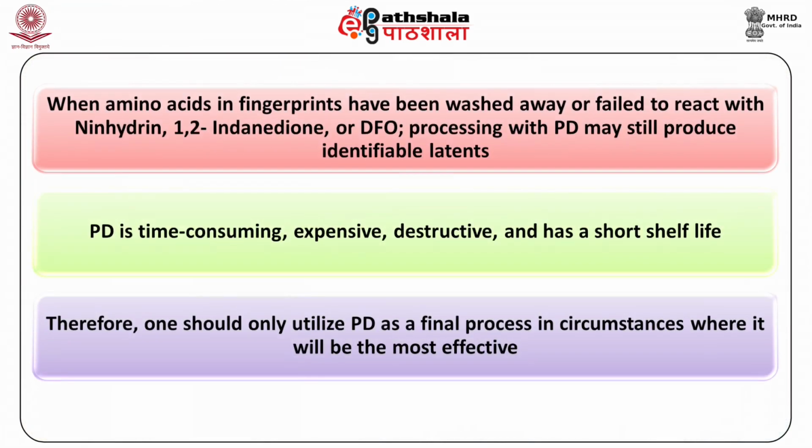When the amino acids in fingerprints have been washed away or fail to react with ninhydrin, 1,2-indanedione or DFO, processing with physical developer may still produce identifiable latents. However, physical developer is time consuming, expensive, destructive, and has a short shelf life.